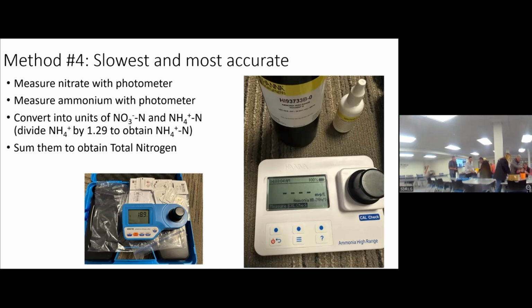There's this line at 10. So you put 1 milliliter of that one. That would be what you expect. There's no nitrate in the fertilizer. Shake it a little bit. You put it there, and you're getting a reading of 0. Now you have to wipe it, because you have to wipe the cuvette.